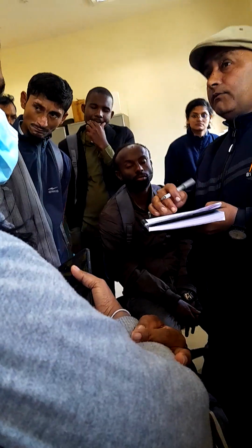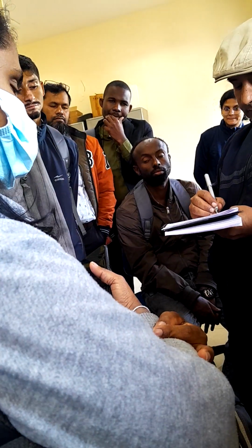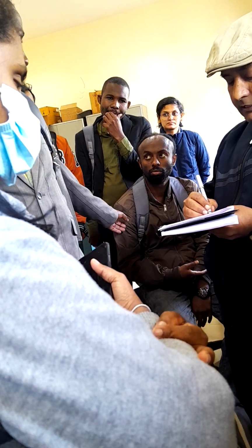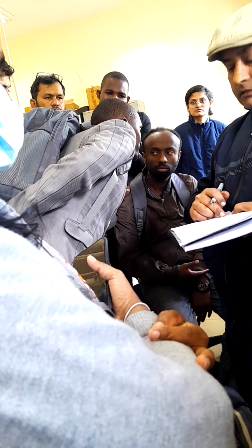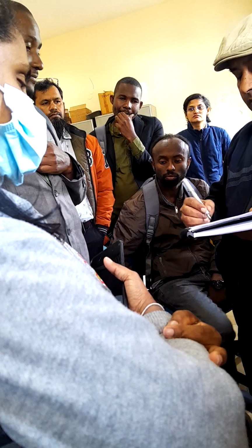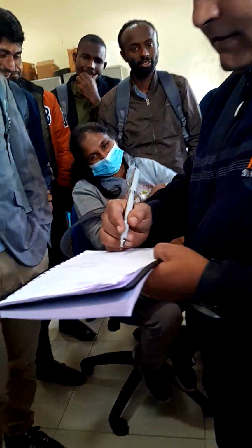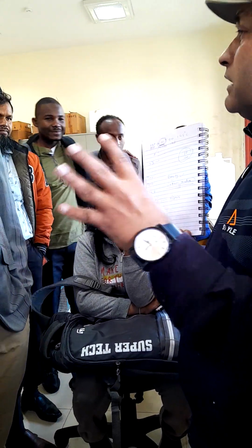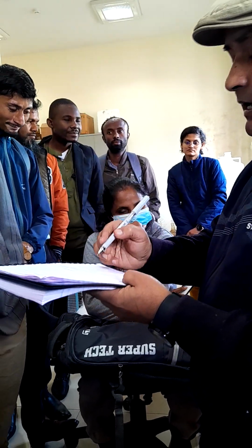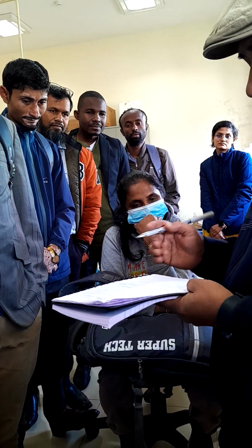Now, another thing which is very, very important: the recovery at 360 degrees centigrade. Recovery of the diesel at 360 degrees centigrade will be a minimum of 95%. If somebody feels a problem, you can sit easily. At 360 degrees centigrade, you require minimum 95% recovery. Now again the question: if 95% is not there, definitely your sample has failed.